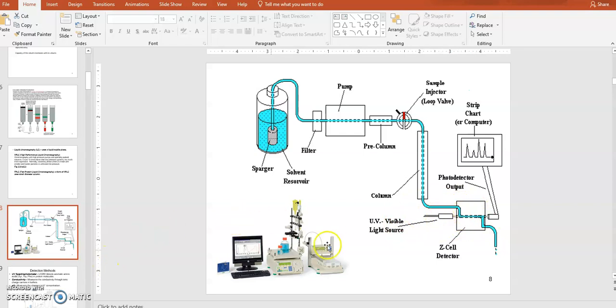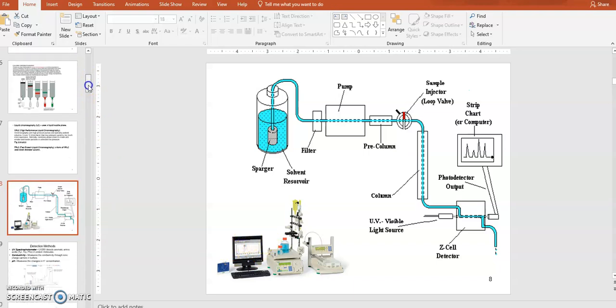Okay. So that's a simplified diagram, but the real chromatography system we have in the lab, one of them is the BioLogic LP system. It's this one. Okay, again, there's the buffer tank, and your column is probably located right there, and then it's connected with tubings, and your pump is right here. It goes through the pump and attaches to the column, and after the column it comes out, and there will be a UV spectrophotometer and the conductivity measure somewhere, and then it goes down to the fraction collector. Okay, where the fractions will be collected, and then the detection will be visualized on your computer screen monitor. So your UV absorption change or your conductivity change will be monitored continuously. That's a chromatogram. Okay, you'll get to see it, and you'll do a lab on this later on.